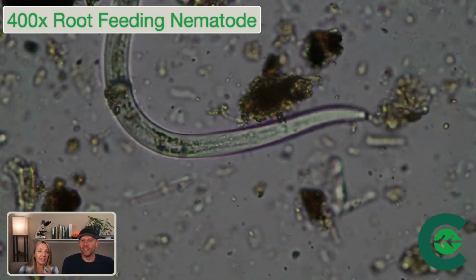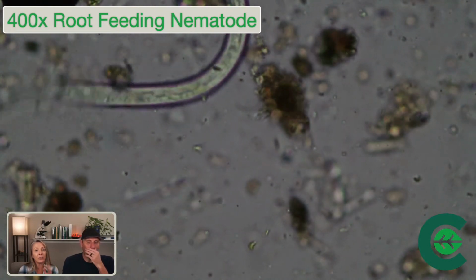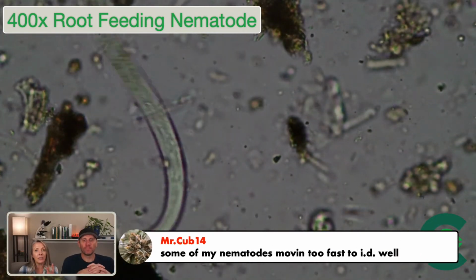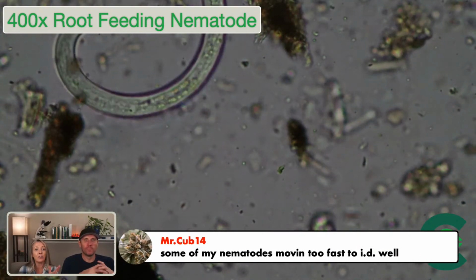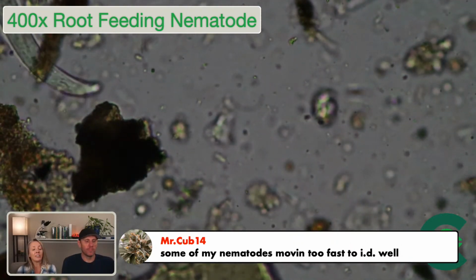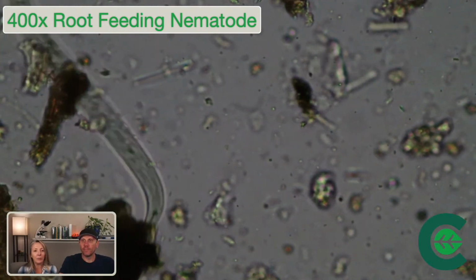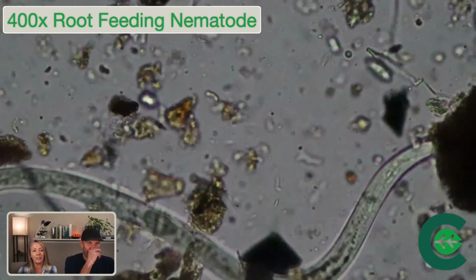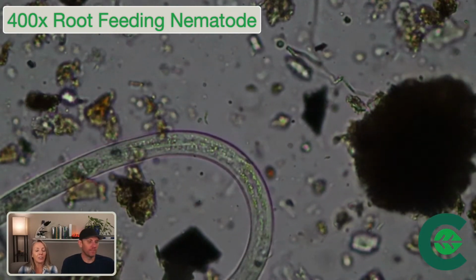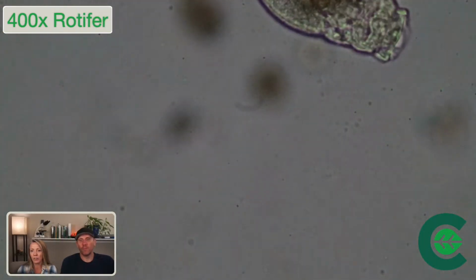The reason I point out that bending of the head is because when it comes to identification of your fungal feeders, they don't have a knob, and it can be a little bit more difficult to see the spear, but when they bend their head like that, you can definitely see the spear that doesn't bend with it. So there is a technique for that. We call it flicking the Bic. You basically wave a little Bic lighter underneath the slide without turning it black, of course, which can be tricky, to get them to slow down so that you can identify their parts.